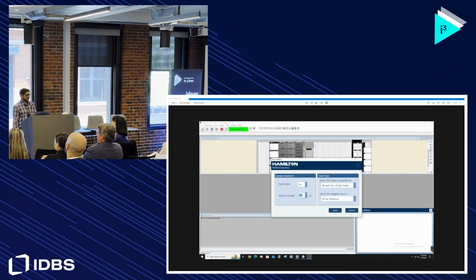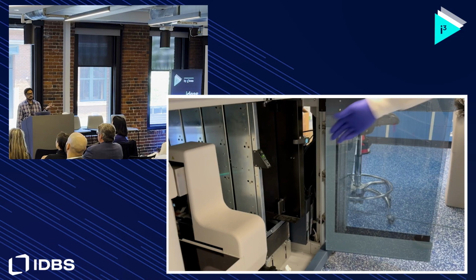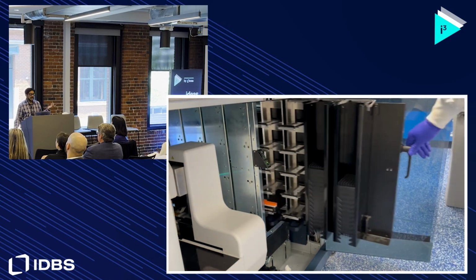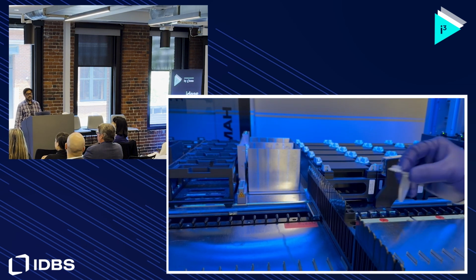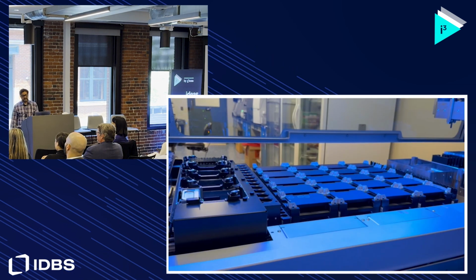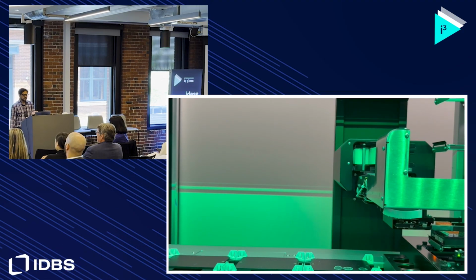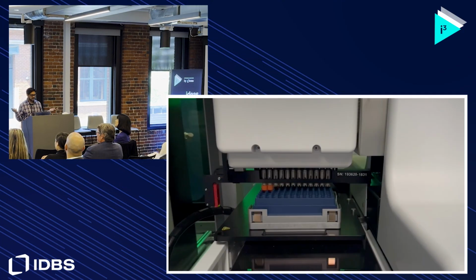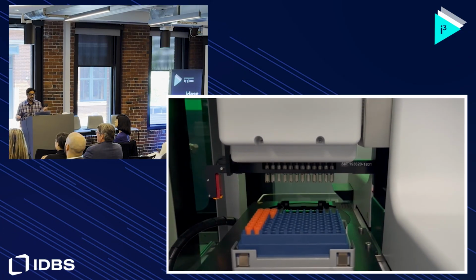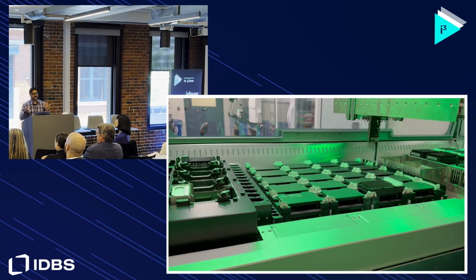It's so good at it now that when I get back to work on Wednesday, I'm going to label 5,000 vials of reference standard, and I'll get it done just me in a day or two. So that's amazing. I don't have to do any of that. Then we also have liquid handlers that can do the filling for us. And so this workflow, now this is a small representation of it, but when you scale it up to 5,000, you can really see how this can benefit you. And usually this would take a team of people to do. I don't need that. I can just do it myself.